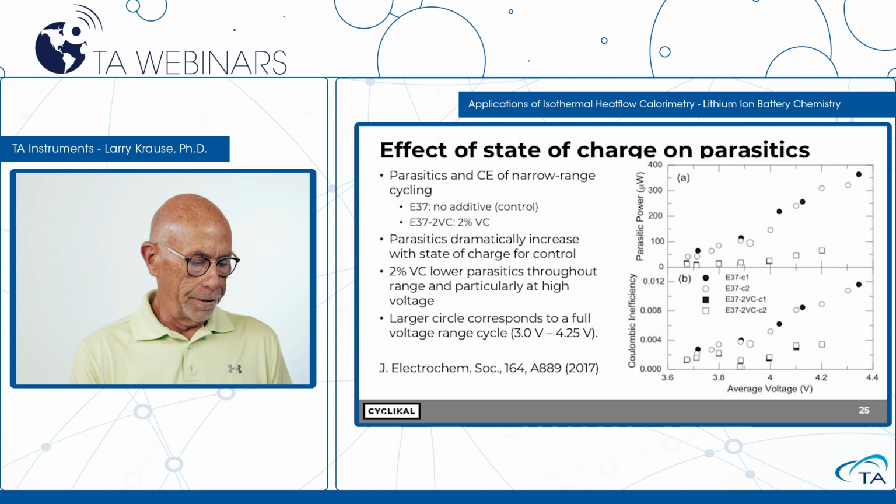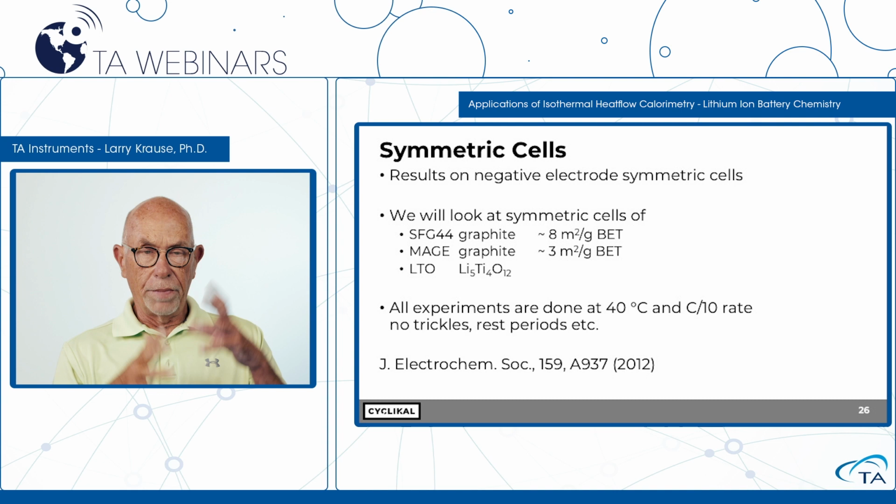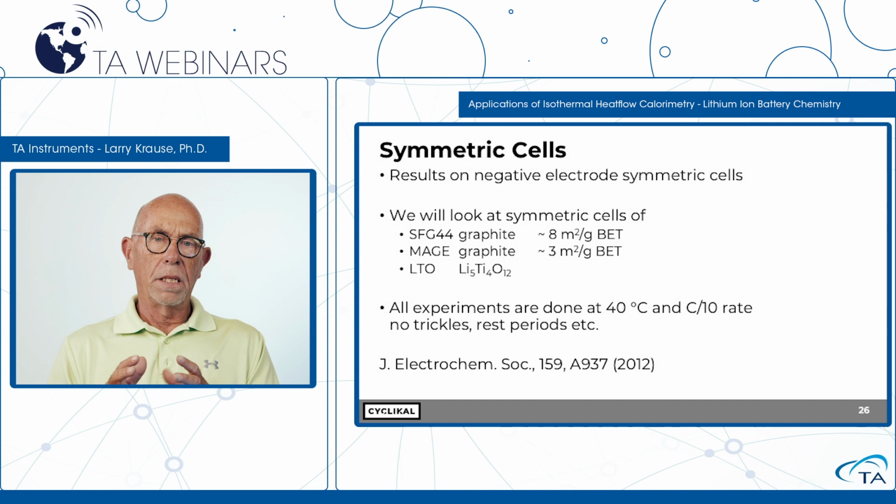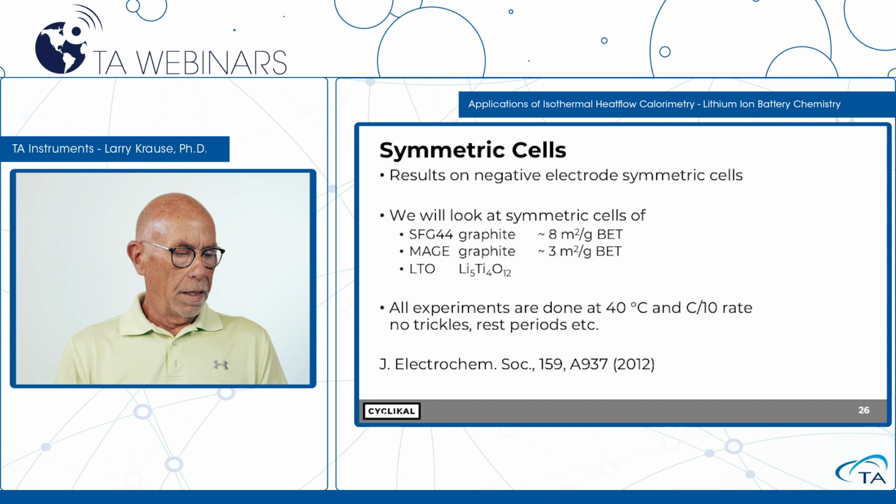All right, symmetric cells. So basically what I've shown you is how we analyze, a standard way we will analyze an electrolyte formulation with respect to its ability to produce a very long cycle life battery. Symmetric cells is something a little bit different. It can also be very, very useful in developing electrolyte chemistry.